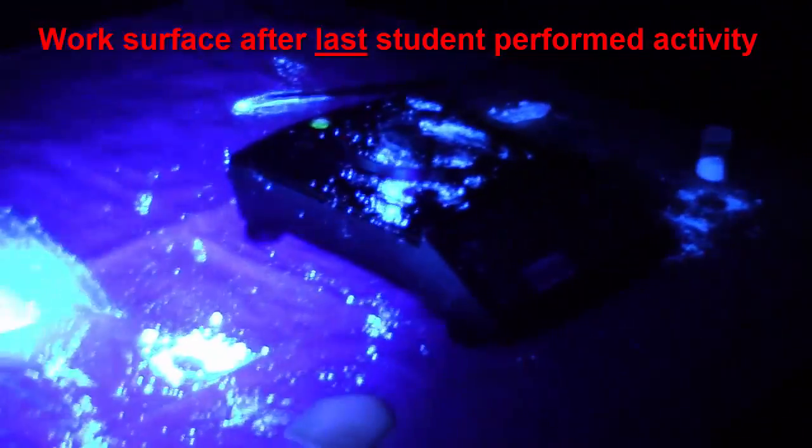Hence, it is important to clean up workstations right after use in order to reduce dermal exposures to other individuals that may use the same workstation later.